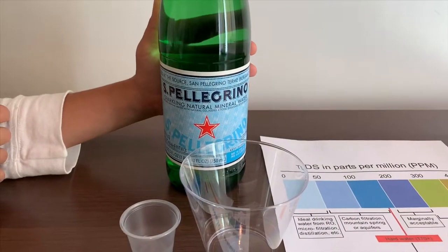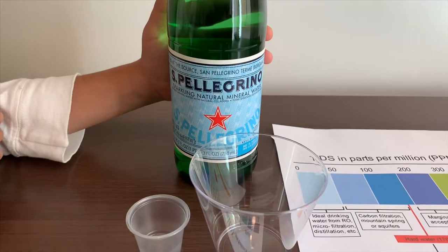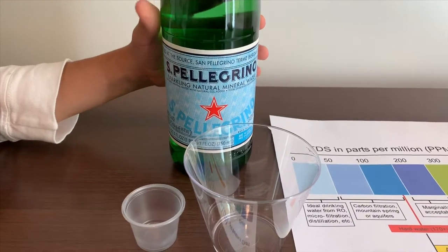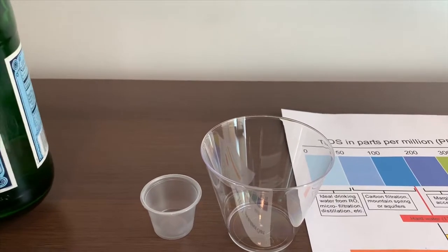This is San Pellegrino Sparkling Natural Mineral Water. It's a product of Italy and it costs $2.50. Let's pour some in to see the TDS and pH.